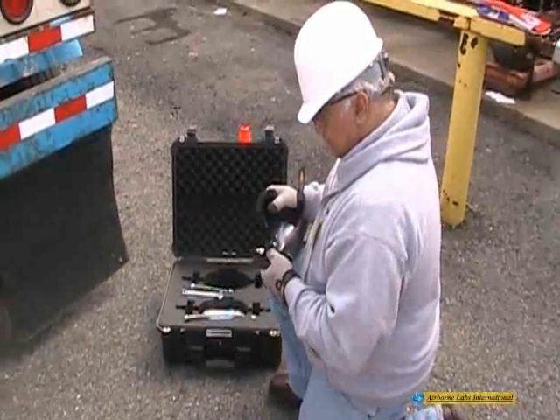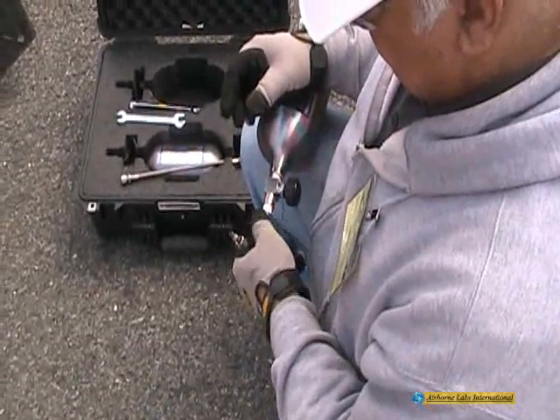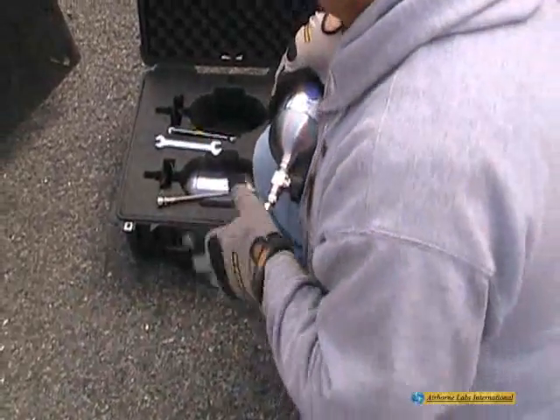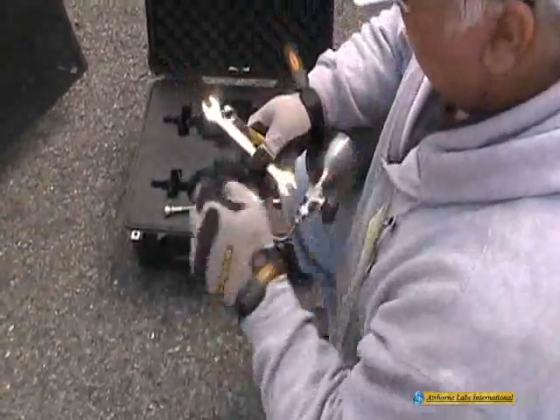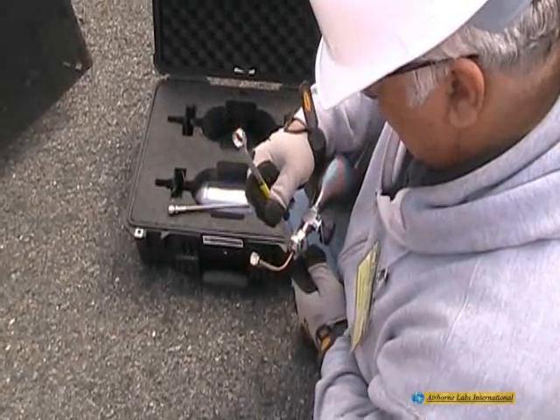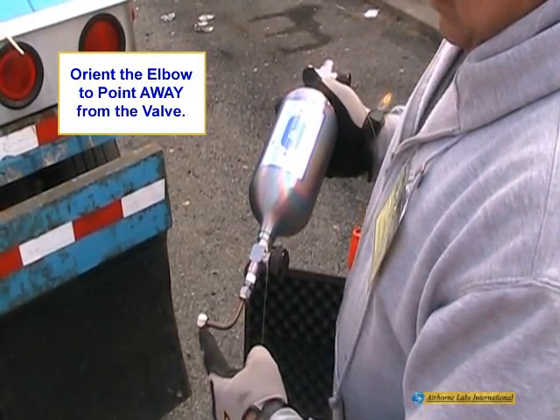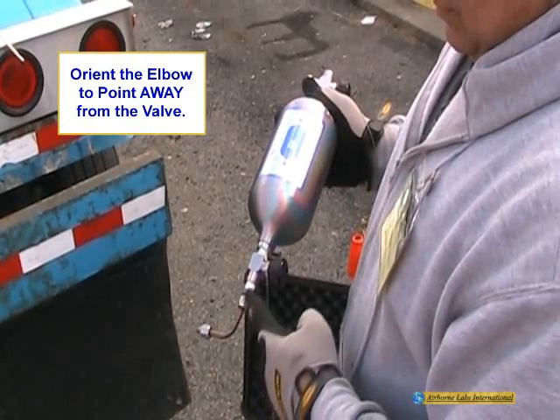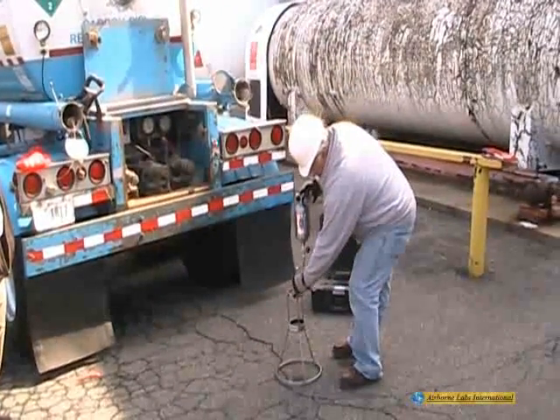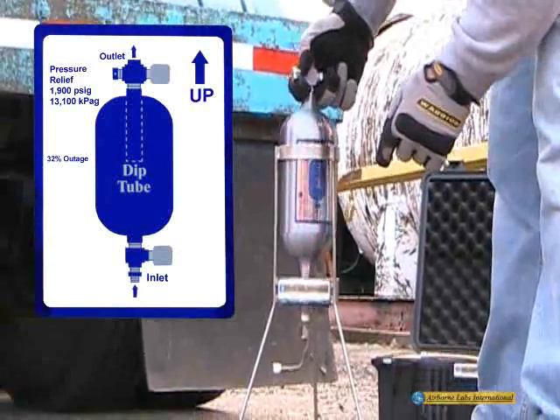Remove both cylinder end caps. Connect the elbow fitting to the SPC 1-liter's inlet fitting, then insert the 1-liter cylinder into a vertical support assembly. Orient the elbow to point away from the valve. The cylinder's decal should be pointing upward.